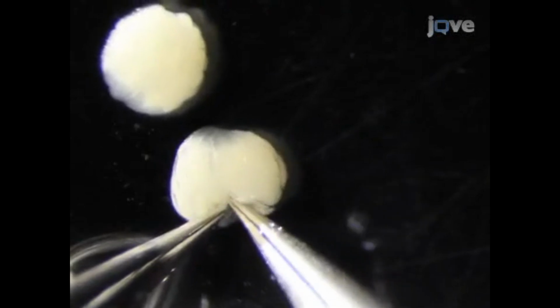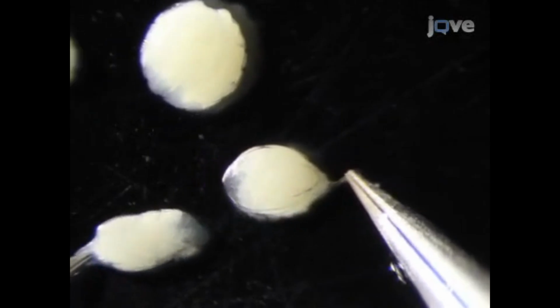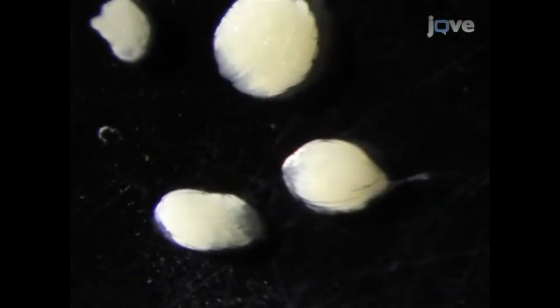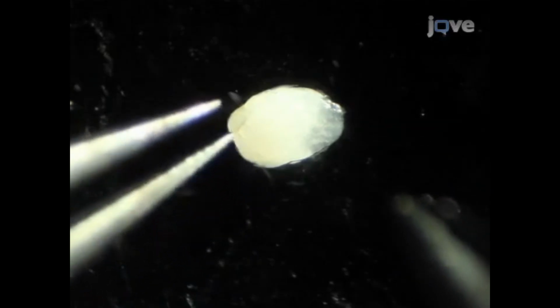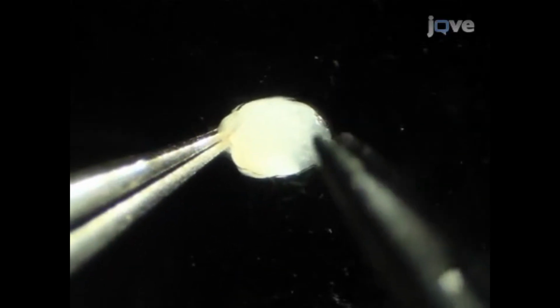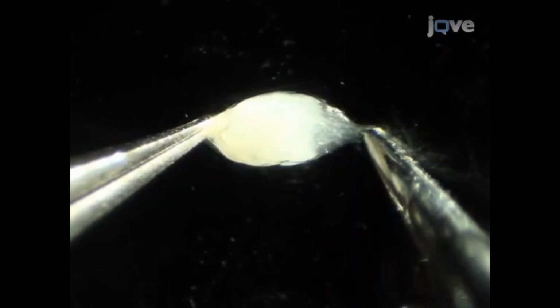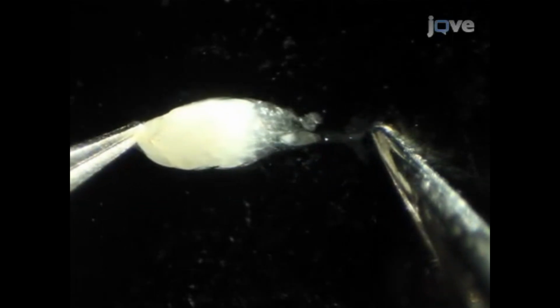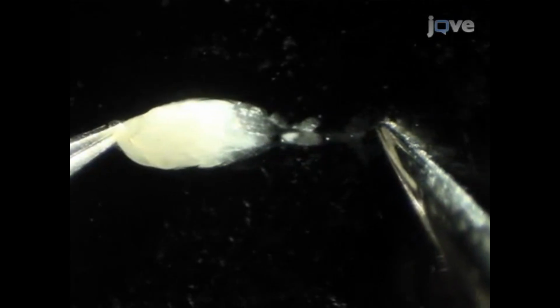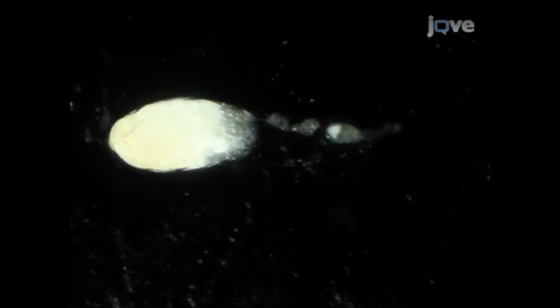With closed forceps, separate the 2 ovaries by removing the connecting tissue at the posterior end. The posterior end has the most mature egg chambers. Orient an ovary horizontally with the youngest egg chambers towards your dominant hand. Then, gently grasp the posterior end by the remaining connective tissue and use a dissecting probe or tungsten needle to tease out individual ovarioles. Individual egg chambers from the germarium stage to stage 10 will separate from each other, but older egg chambers will stay attached to the ovary.